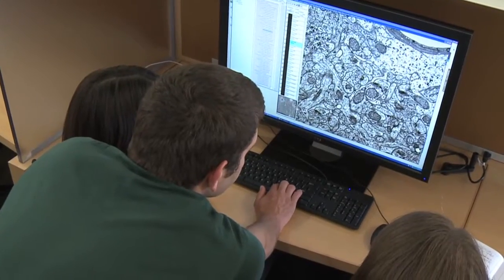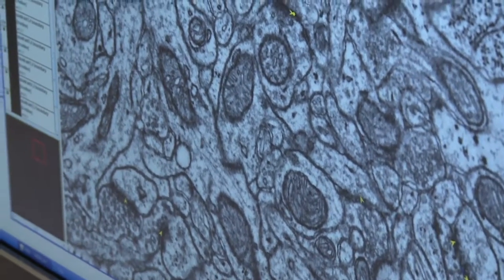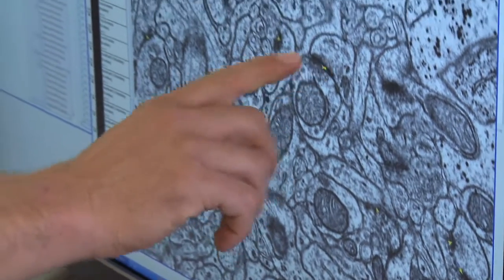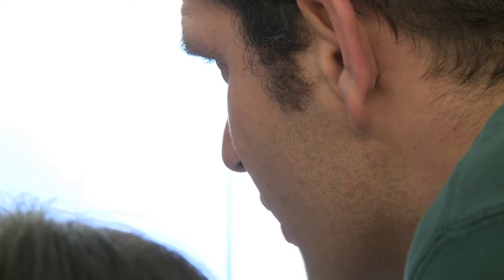That little branch ends. So that's the kind of thing I would like to get — to capture those little branches. One branch ends and the other one continues. Just tag the last node to say it rejoins, but I don't want to worry about that at this point.